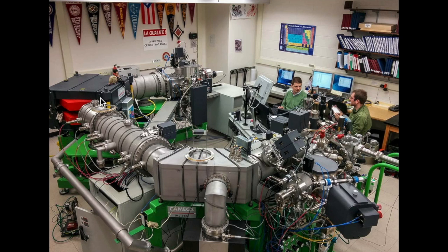This magnet deflects our ions based off their mass into the detector located back here to the left of this person. This is our sample workstation, so we can actually receive results live as the isotopes are hitting the detector, and so we're able to assess our data as we make these measurements, which is pretty cool.